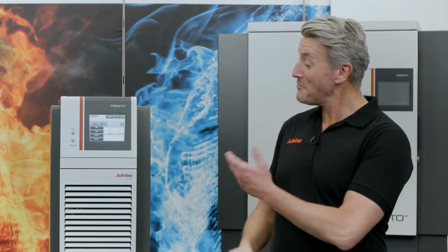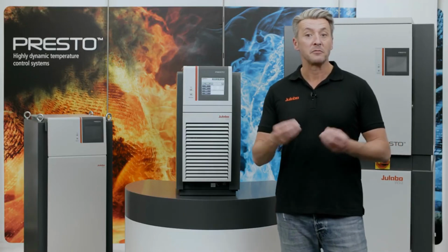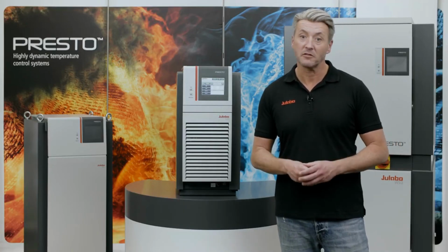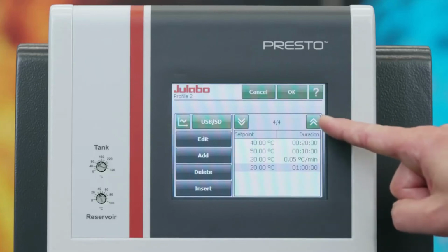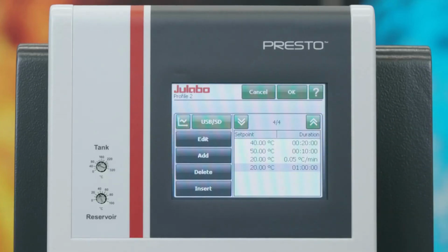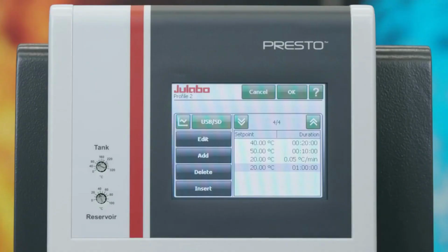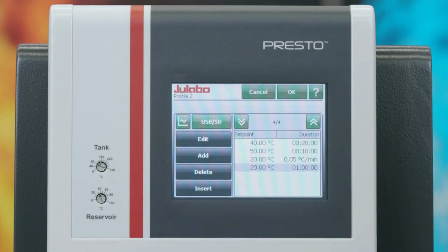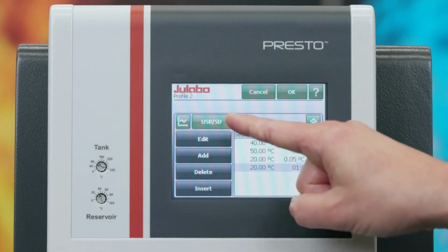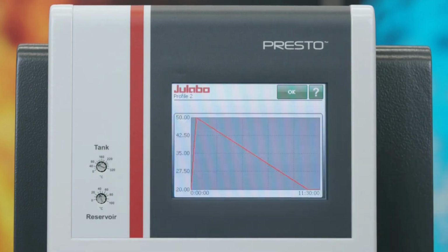That's it! The profile is now ready for use. Of course, the times can only be achieved if the performance of the Presto is sufficient for your application. In the submenu, you can review all steps in the desired order. Now, you have different options to manage this profile. You can also edit, add, delete, and insert steps. Additionally, you can import a profile or export a profile to a USB stick or SD card. You can display the complete profile as a chart as well.